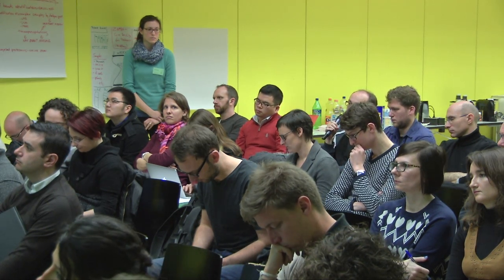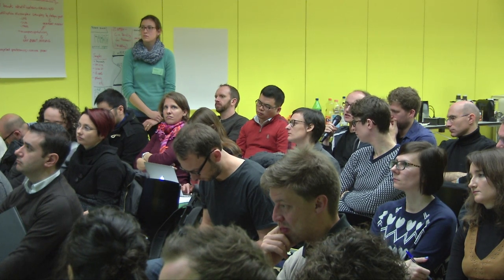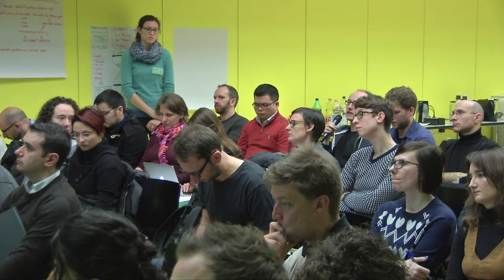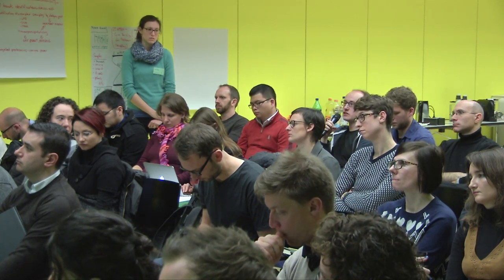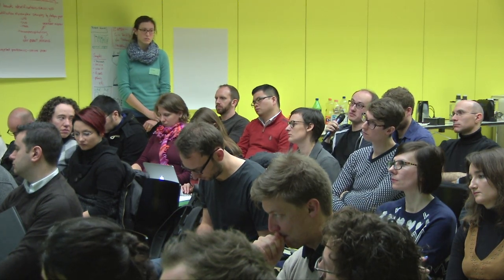So another question on the P100 panel, I guess. The way I understand what you did in the first step to get to this list, you measured 1,500 phosphosites. You weeded out everything that doesn't change, but you probably also collapsed things that are redundant. For example, if you have a certain set of phosphosites that look the same across many conditions, you pick one of them. Is this— That's right. Yes. Yep. I'm wondering whether now you can use this to reverse what you have done to, for example, predict the phosphorylation state of a certain protein based on, let's say, drug treatment based on this set. If it works, it would be very great.